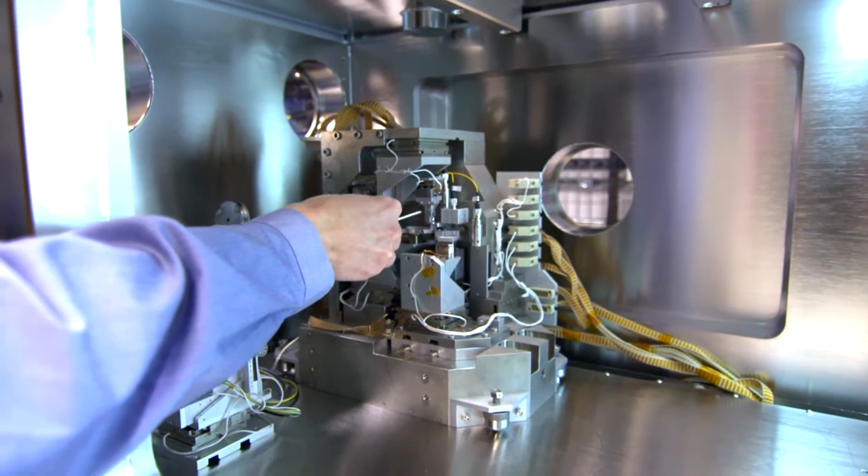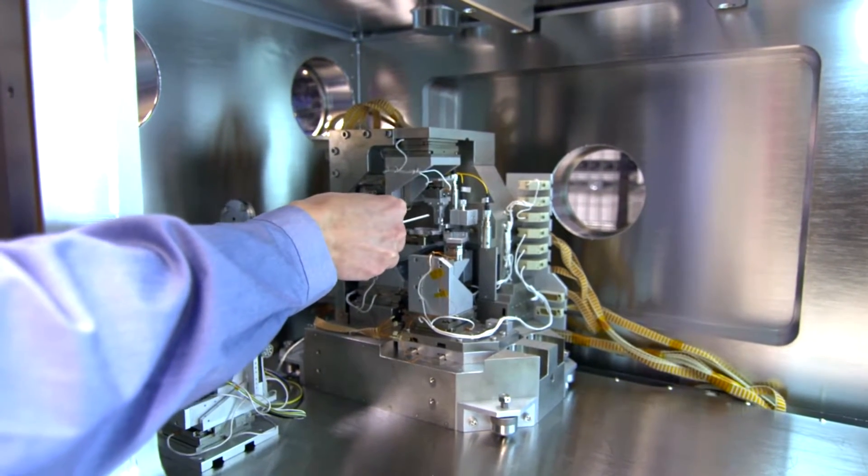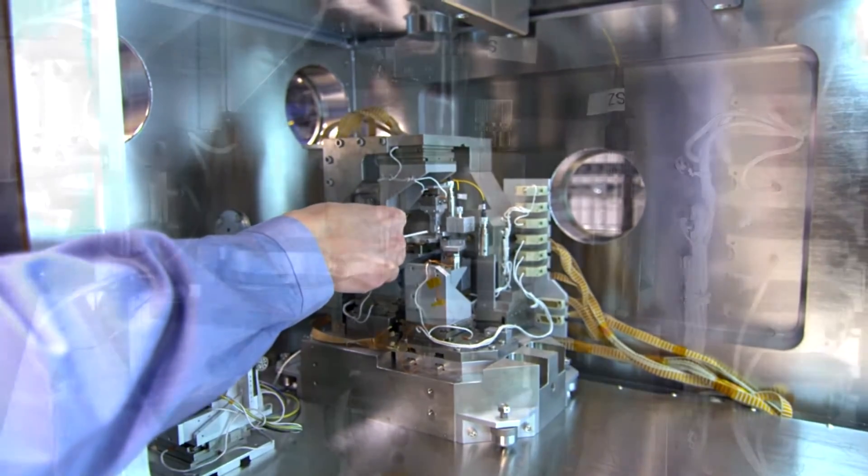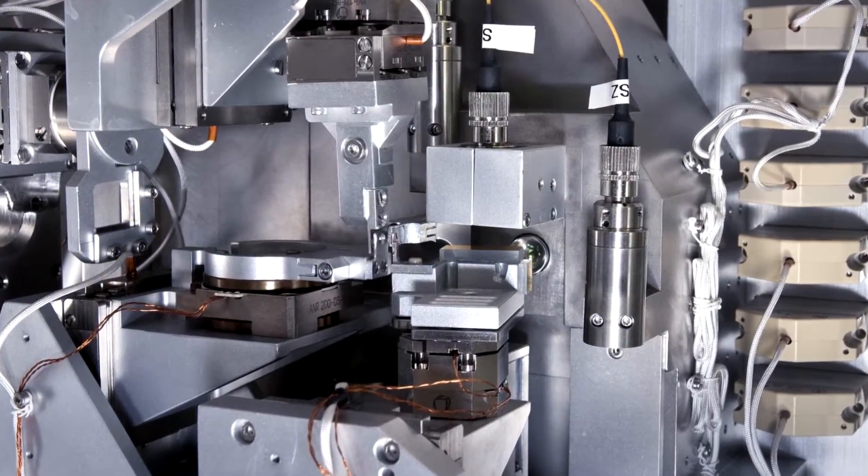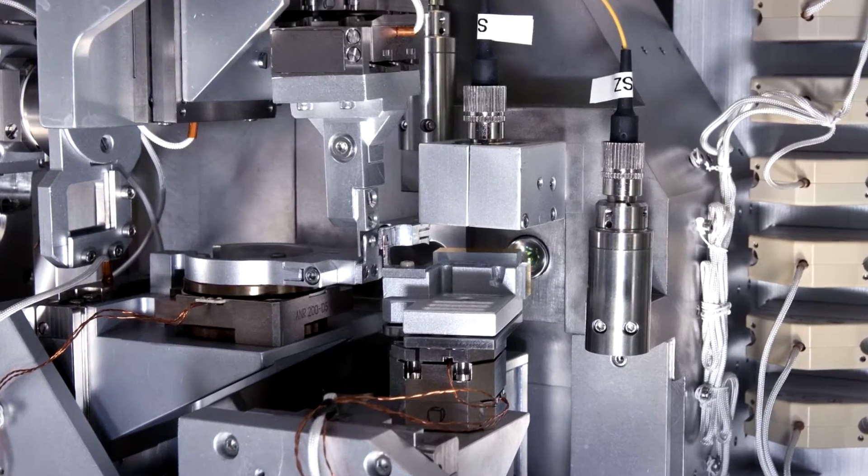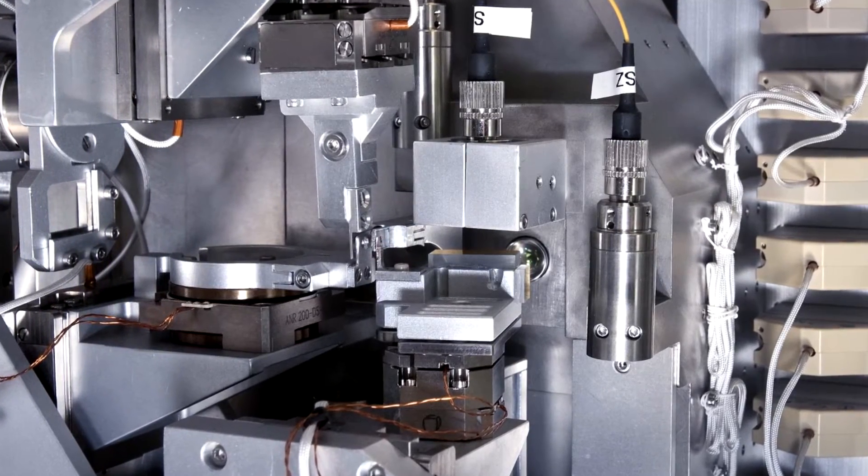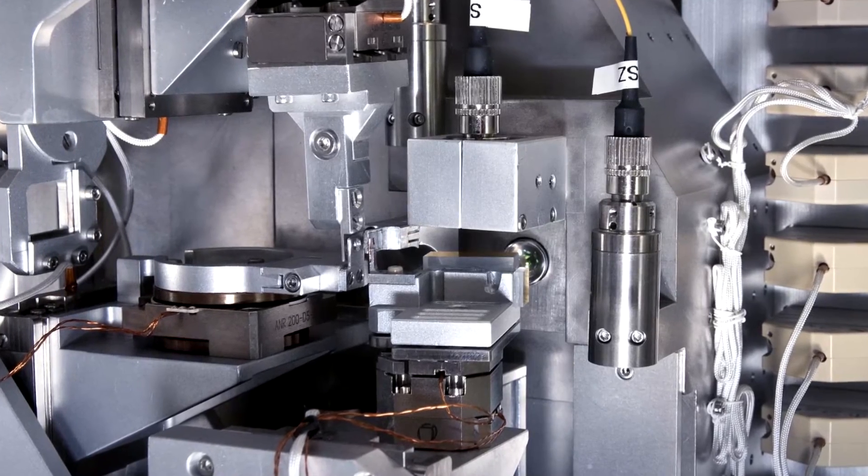And these are two lenses. This is the vertical lens and the horizontal lens. You can see how close they come. And then there is a filter in between, which helps us to filter the signal. So you can see how small all these distances are.